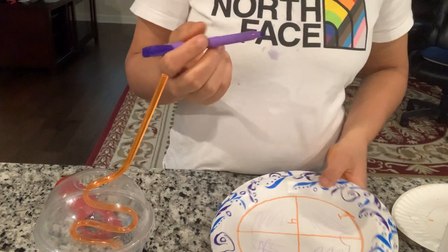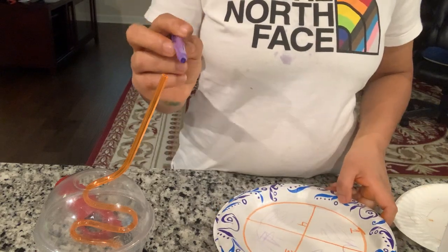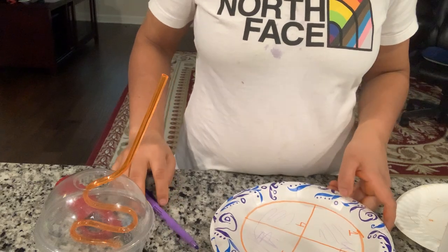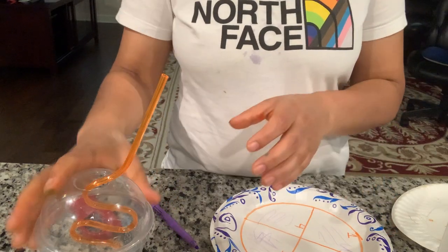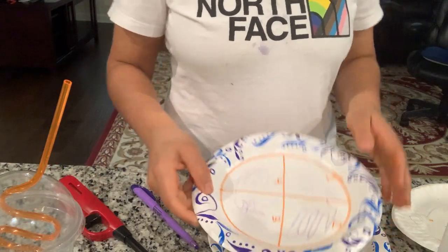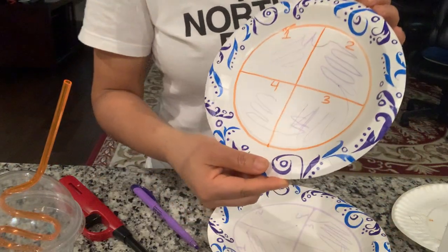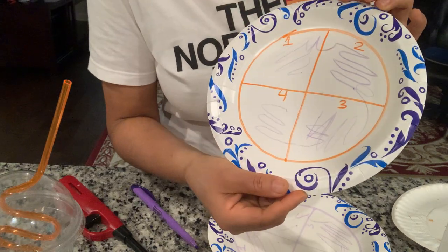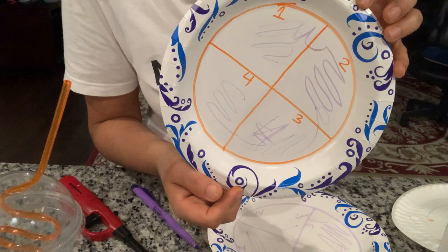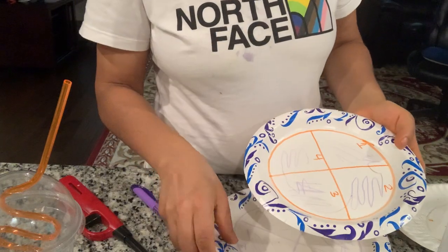Finally I'm sterilizing my loop and turning off my Bunsen burner. This is what my quadrant isolation streak and agar plate look like. And I'm going to put on the lid.